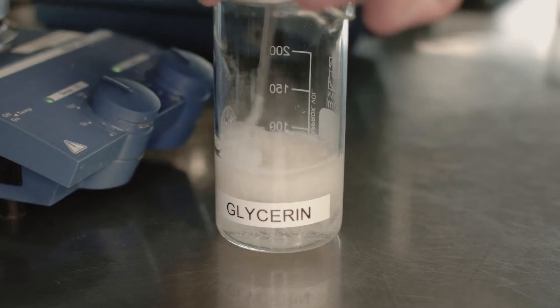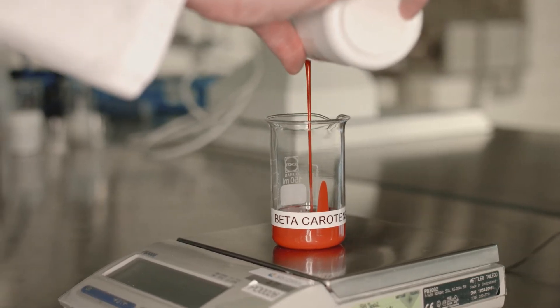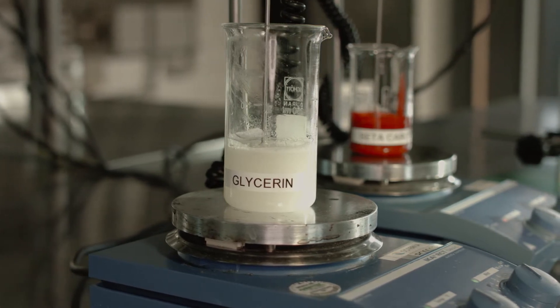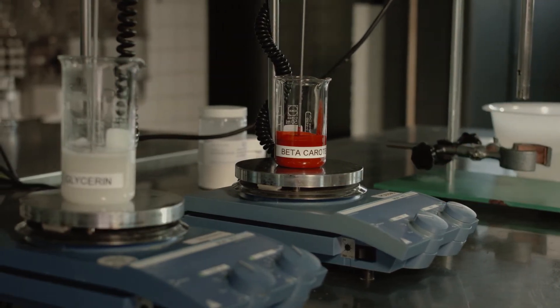First, a concentrated emulsion is prepared. Later, this concentrated emulsion can be added to low viscous watery liquids forming the final emulsion. With the use of sucrose esters and this concentrated emulsion technique, small oil droplets are obtained, even smaller than one micron. A high shear mixer will give sufficient shear to reach this.